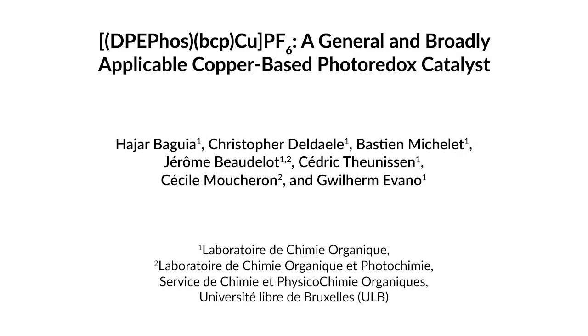Photoredox catalysis has emerged over the past decade as one of the most efficient methods to promote radical processes. It is indeed especially easy to implement, user-friendly, highly sustainable, and also it does not rely on the use of toxic or hazardous reagents that are usually used in radical chemistry.